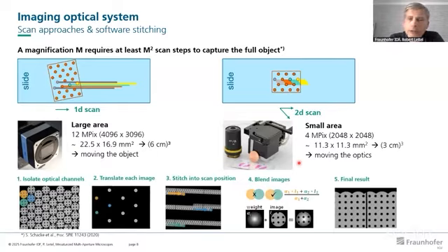And what happens with the recorded images? If you had a static image, what you see from the multiple channels is that they are arranged in a hexagonal arrangement. All these channels each take a certain part of the image of the full frame. And then, when moving the sensor or moving the image, we can lead this to a stitching across the scan dimension.